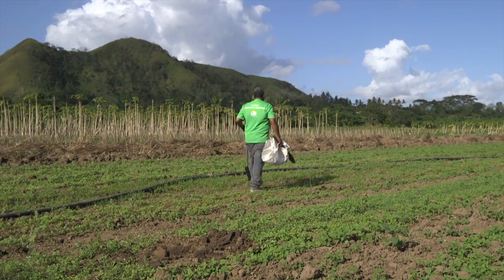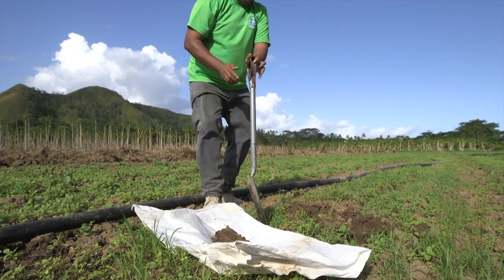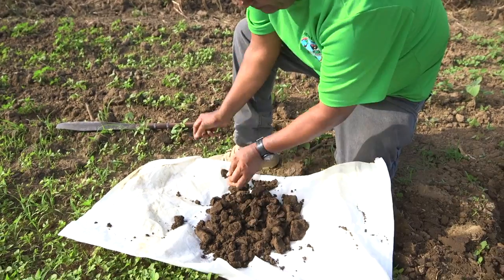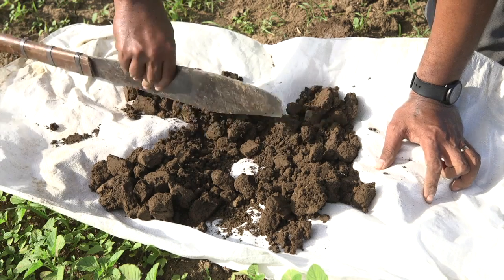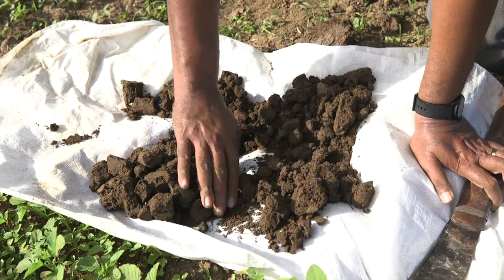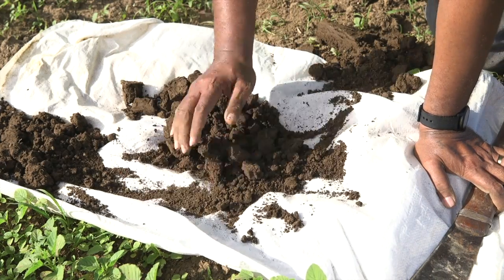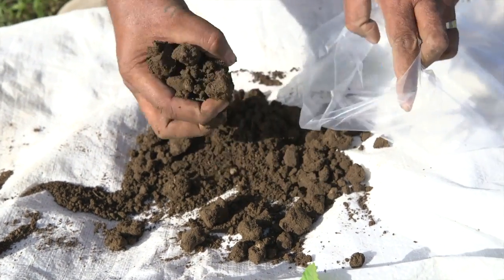Following that, collect all the centerpiece and mix onto a sack. Flatten the soil and divide the mix into 4 equal parts. Then remove any 2 opposites of the quarters and mix the remaining 2. From that, pick a handful of soil and place into a plastic.